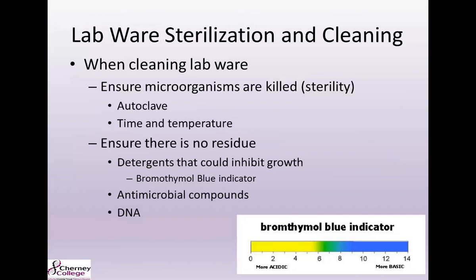Labware, sterilization, and cleaning. When cleaning labware, you're going to want to make sure, obviously, that any microorganisms are killed via autoclave. So make sure all your labware is sterile by autoclaving it at the appropriate temperature for the appropriate amount of time. Typically, it's recommended that it maintains 121 degrees Celsius for at least 15 minutes.